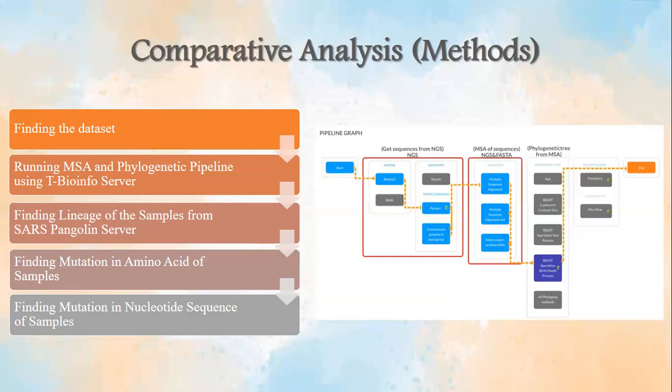The third step is finding the lineage of the samples from the SARS Pangolin server. We go to pangolin.cog-lineage.org, upload the FASTA sequence for each sample, and click run to get the closest lineage for each sample. The next step is finding the amino acid mutations of the samples by searching for the specific lineage on the outbreak.info site. After that, we can find mutations in the nucleotide sequence of the samples using the MSA table obtained as a result of the MSA pipeline.